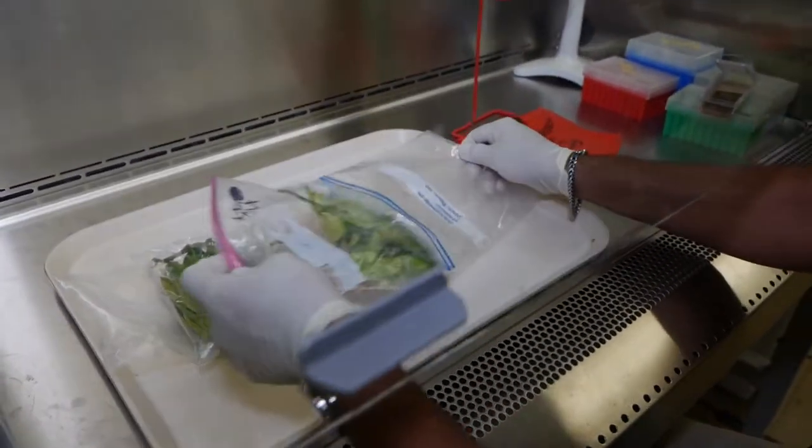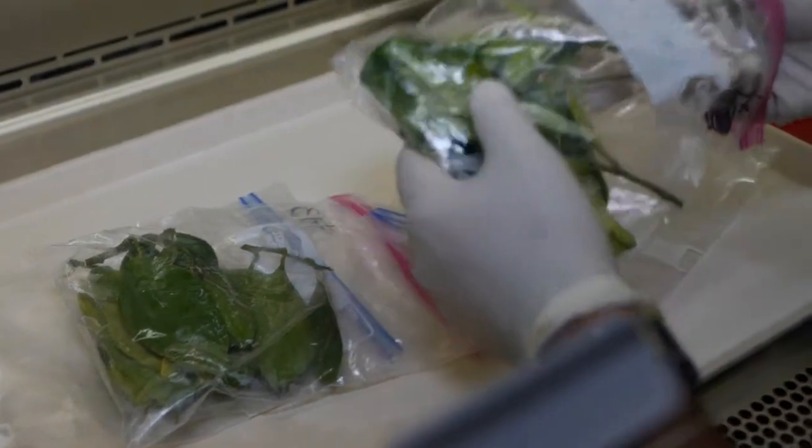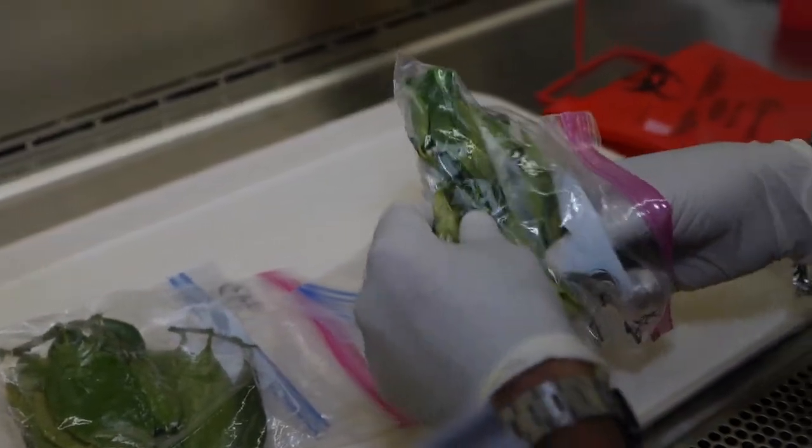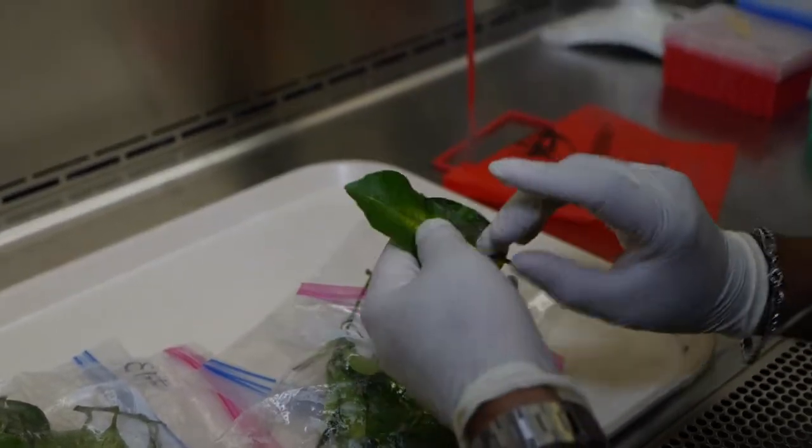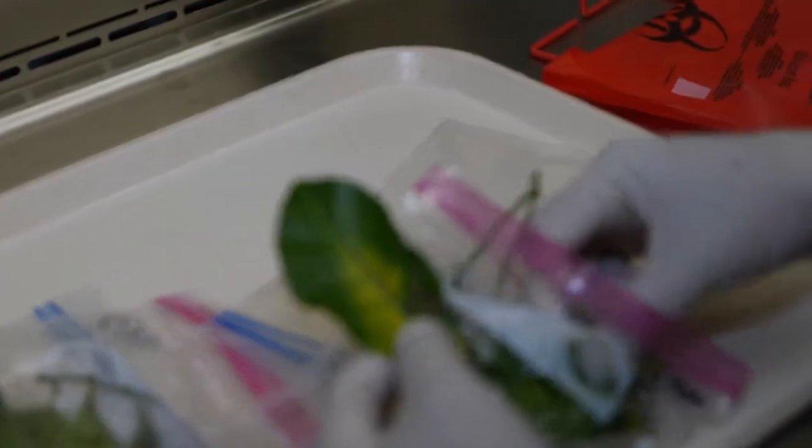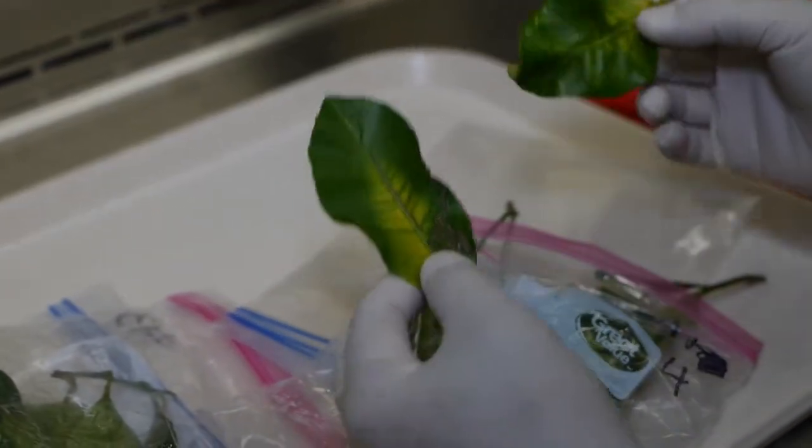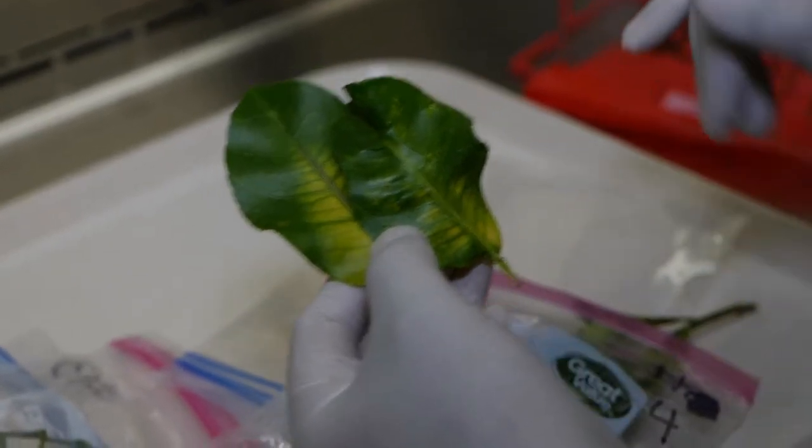Here I'm just visually examining it. The test we're going to run for it is a molecular test, but I want to make sure we're looking at something symptomatic for citrus greening. You can see this type of blotchy mottling here and here.